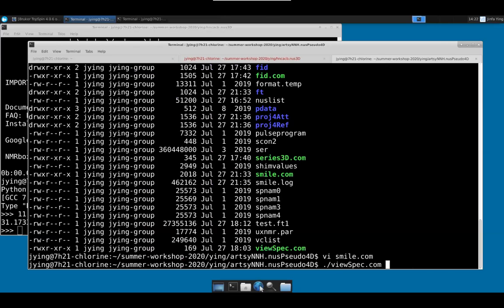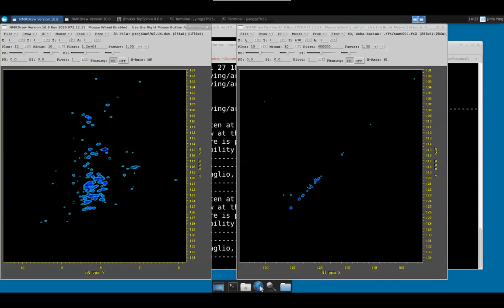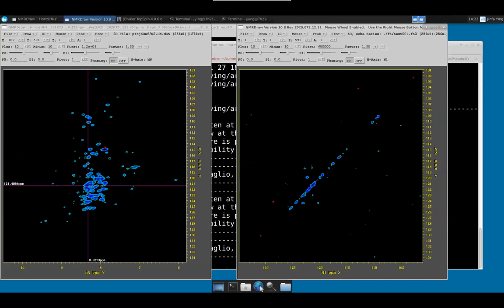The spectrum is like this, you see? If you go to somewhere, you see peaks like that, and this is the first cube. If you go to A equals 2, the second cube, you see some are negative and some just disappear. That's because the coupling is there and the signal is attenuated, and if you take the ratio of the two spectra, you get the coupling.